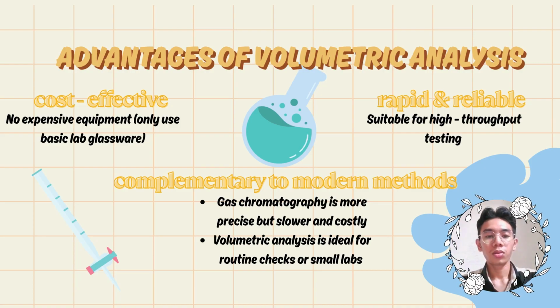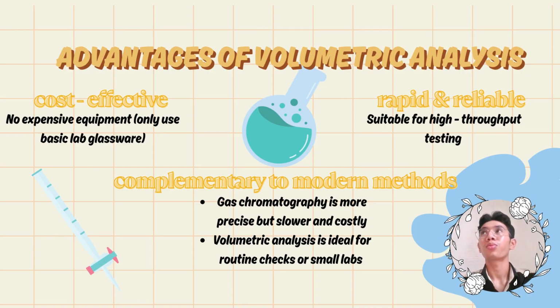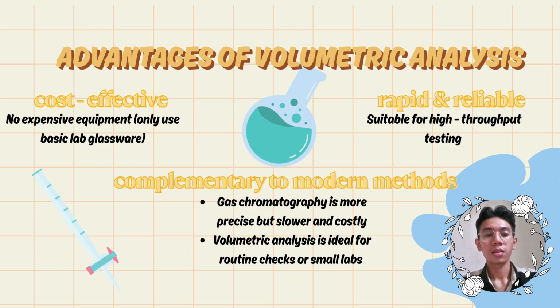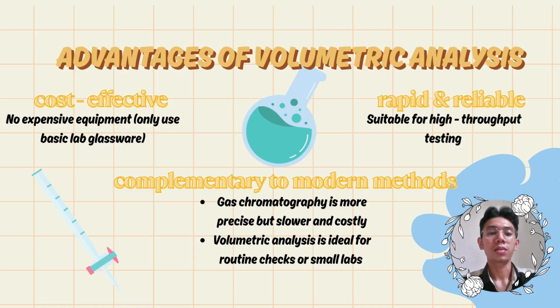Here is why we use this method. Volumetric analysis is cost effective, using simple lab glassware like burettes. It's faster than gas chromatography for routine checks, making it ideal for small breweries or quality control labs.